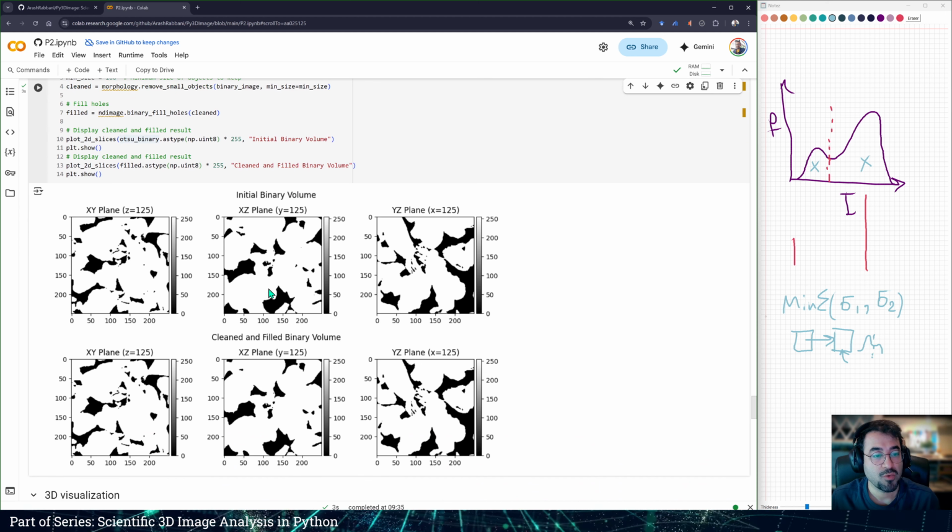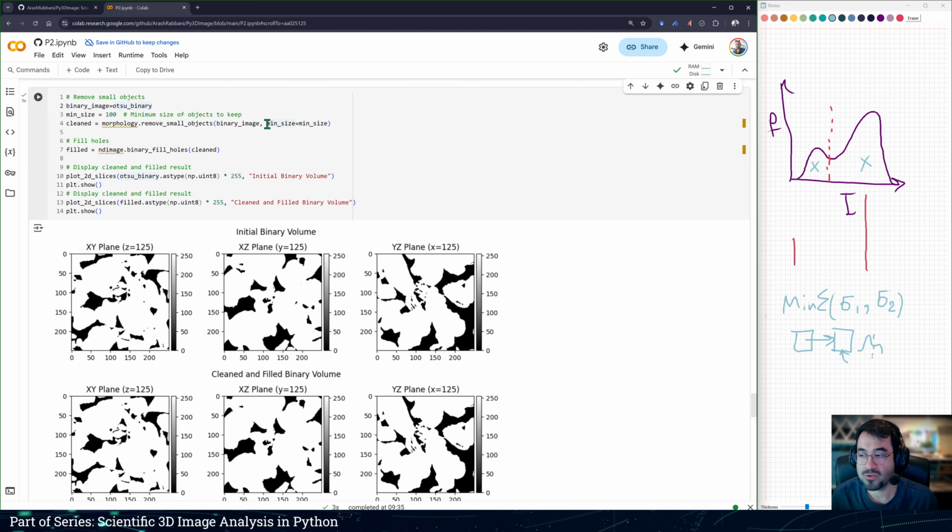If you don't want too many tiny isolated islands in your image, and it doesn't make sense theoretically, for example, an island means a sub-particle hanging mid-air without being connected to anything else, you can use these useful functions in the morphology part of scikit-image.